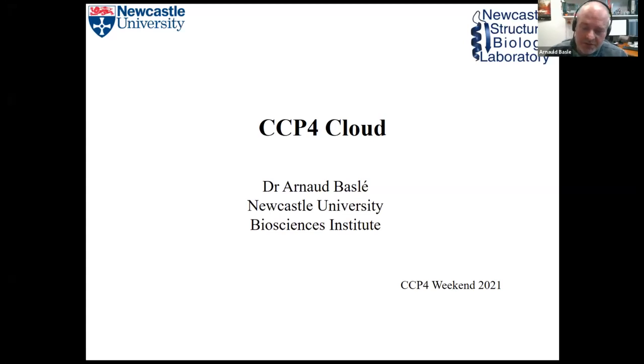Thank you. I would like to thank the CCP4 core team for inviting me to give a short overview of CCP4 Cloud and how we use it at Newcastle University.